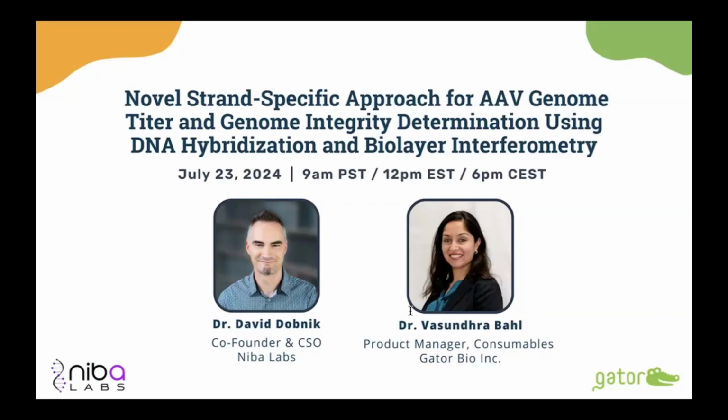So a bit more evaluation of such material would be needed. As said, if you're using AAVs, you might not be completely sure how much of those specific strands you have inside. So my preference would be a bit more controlled material like, let's say, fragments of DNA, double-stranded DNA.